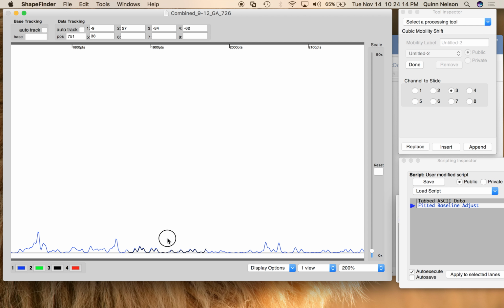and you should do it along with me. I'm not moving super fast. I'm just scrolling a little bit, clicking in the same spot of the screen, and just dragging and aligning similar shapes. Okay, this is just trying to find patterns of peaks and align them.